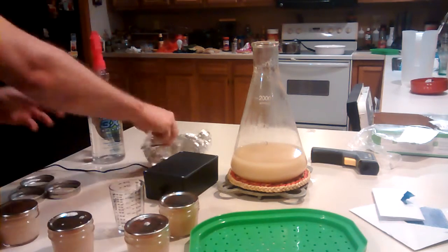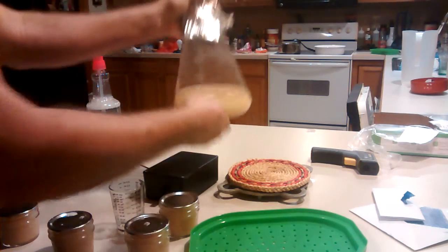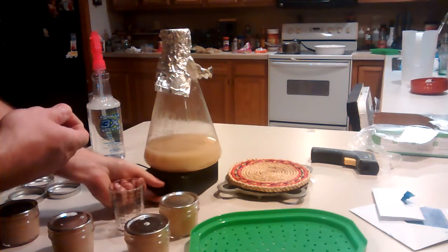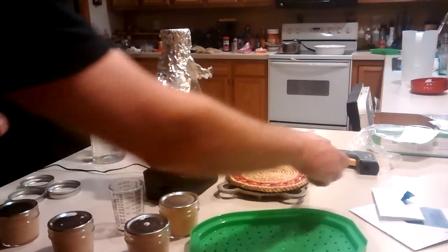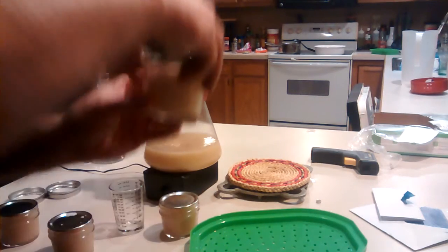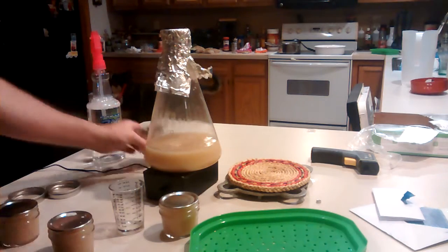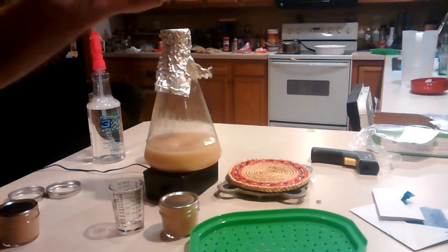Okay. Cap this guy back off, and pull the magnet off the bottom. Put it right back up with the stir, back on spin until I'm ready to pitch in the brew, which is, I don't know, probably about 22 minutes from now, I'm thinking. As far as these 4 later batches of yeast, put those on, just leave it a tiny bit loose. I want some more CO2 to be able to escape for a day or so. Help push out any oxygen and whatnot.